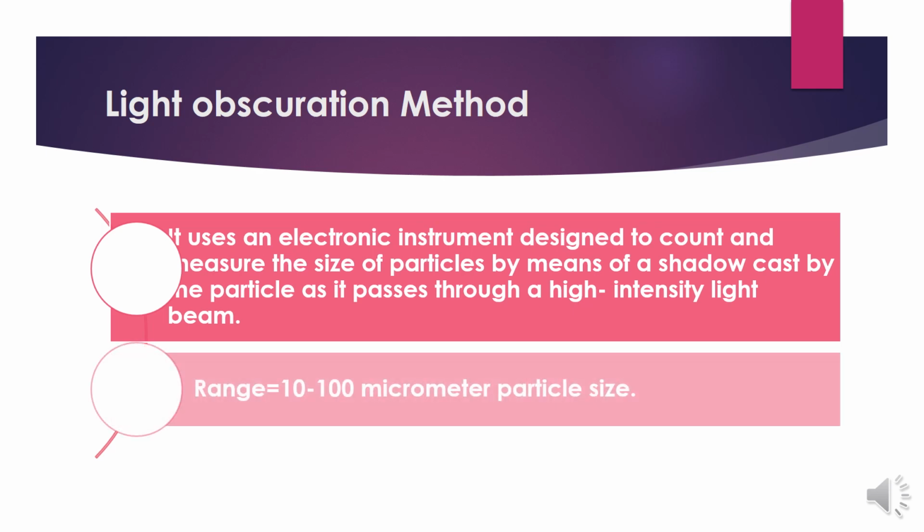Its detection range is between 10 and 100 micrometers. It means if your preparation has particles of 10 micrometers up to 100 micrometers, they can be easily detected and counted by this instrument, which provides you the result.